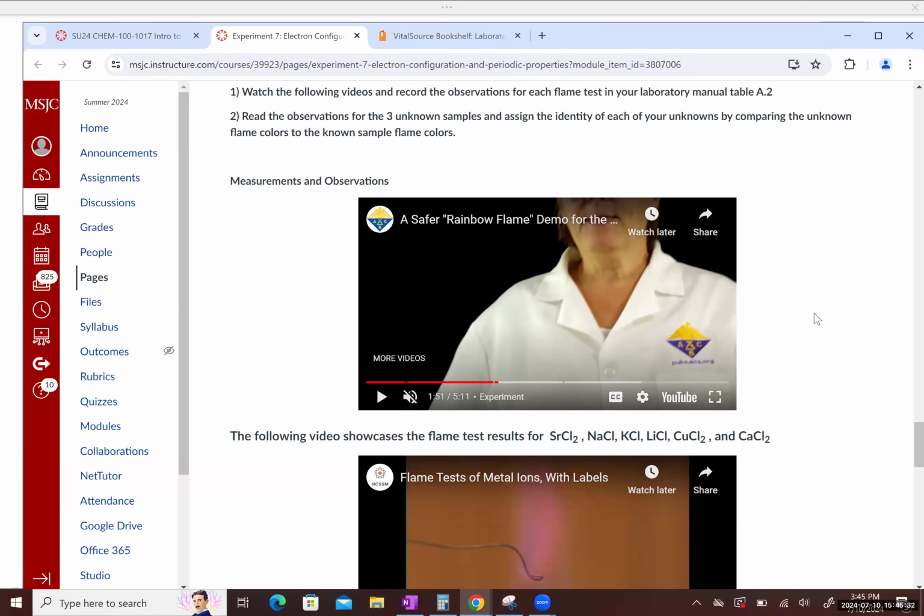Okay, so I already have pulled up the first video, and this video showcases the flame test results for strontium chloride, sodium chloride, potassium chloride, lithium chloride, copper chloride, and calcium chloride.